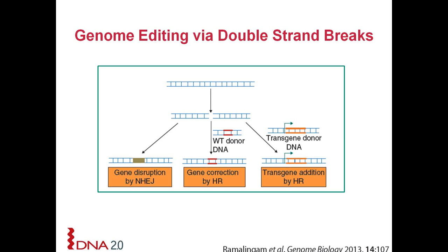Back to a minutia question, which is how many colonies do you typically check? Again, it depends on the host and depends on what sort of change I'm putting in and how the guide RNA tool, when I look at the guide RNA, I've selected how well I think it will work. But typically between 4 and 20 clones. 20 is the most I would do before I throw in the towel and try something different.